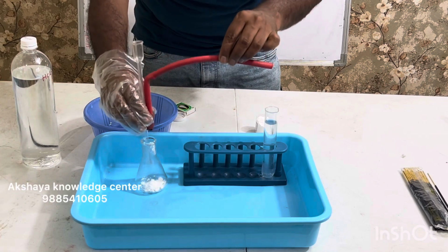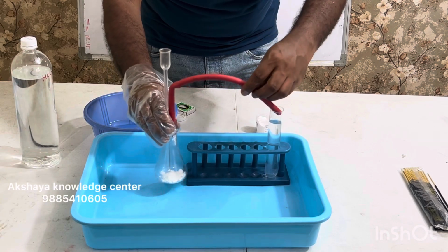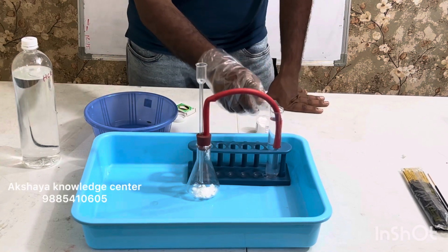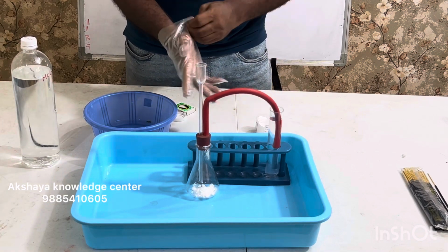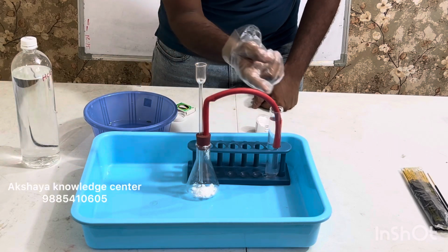So the advantage of using this thistle funnel is I can place this pipe inside the conical flask, and the delivery tube inside the test tube with lime water, and now I can pour acid in this directly. When I pour acid in directly, the reaction would happen and the gas would release from this pipe.